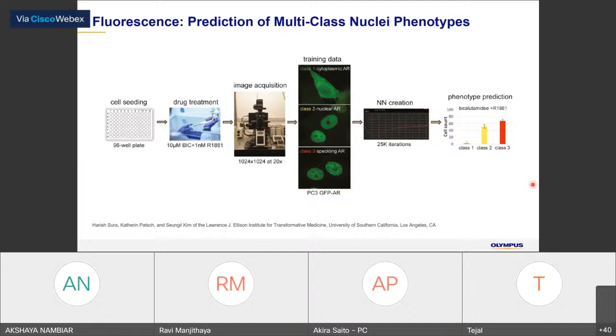I mean, they look similar apart from the speckling in the 3-class image.